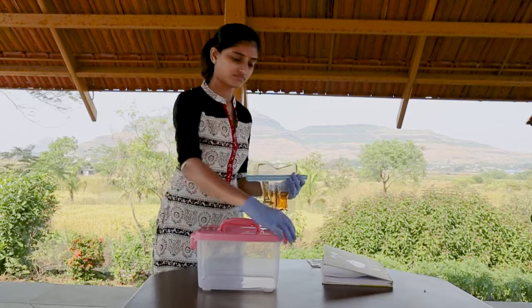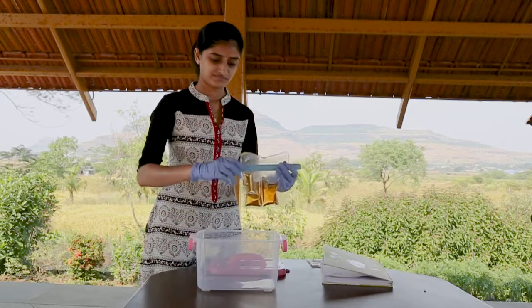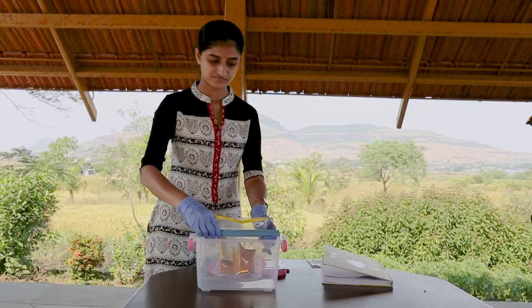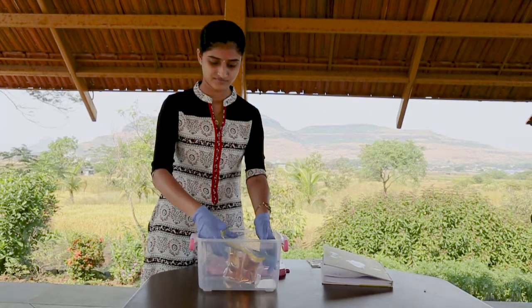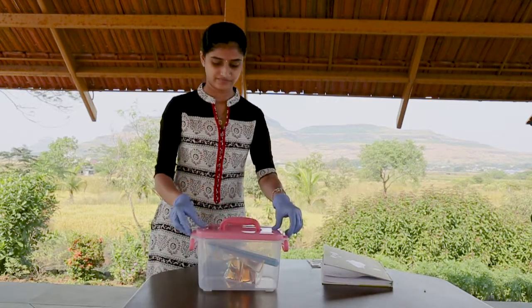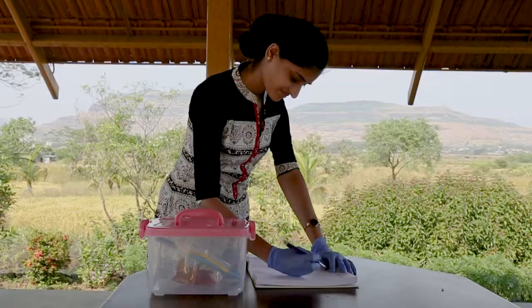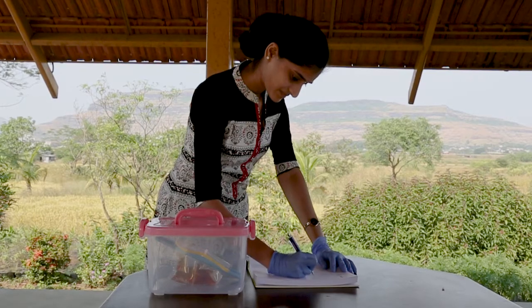Next, incubate the sealed bag for bacterial growth. Incubating is fine for temperatures of 25 degrees Celsius and above. For lower temperatures, use an insulating container or portable incubator. Be sure to check the High E. coli instruction sheet for specific incubation times and temperatures.